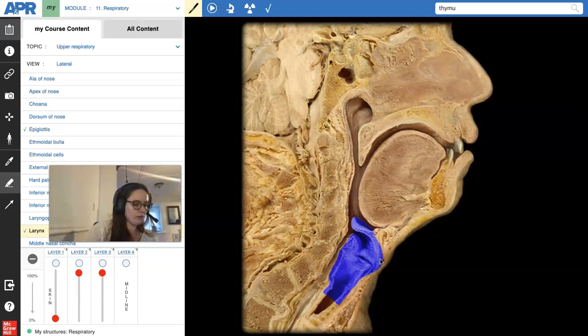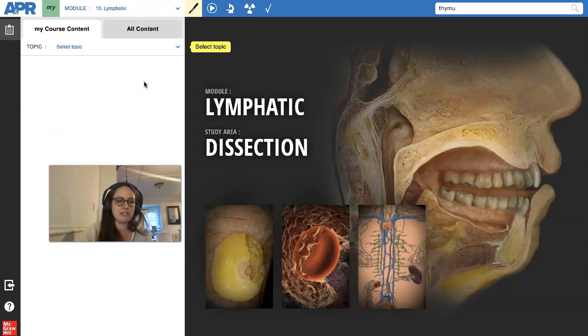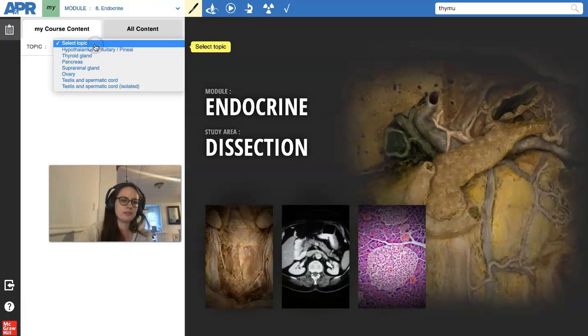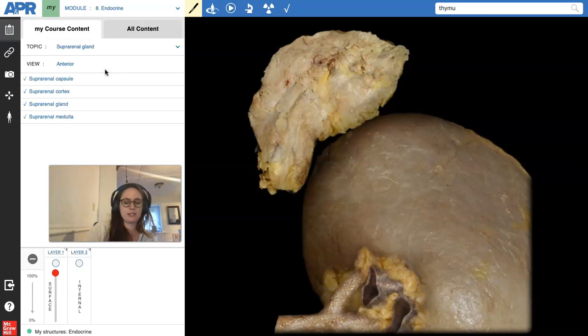Okay, I think the only thing I'm missing is a couple of lymphatic structures. We got a view of the thymus for miscellaneous structures, but you can see that this is a really lacking list for... or sorry, I need endocrine. Endocrine is the one that's a really lacking list for endocrine structures. Now, it's on your list as adrenal glands. Ad means above. Another thing that means above is supra. So suprarenal glands and adrenal glands, they're the same thing.